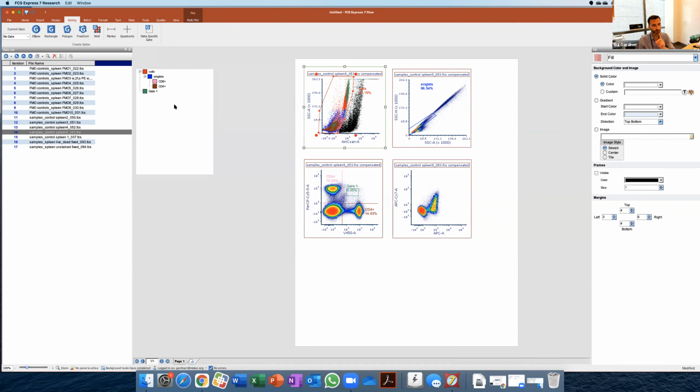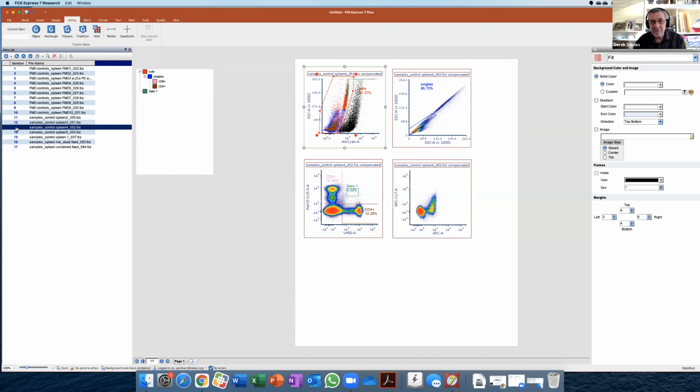Having said this, that's just one sample, right? Yeah, there are 60 or something people on this call. I think if we gave them all that data file, none of those gates should be in exactly the same place, but we would all come up with approximately the same answer. Exactly. Exactly.